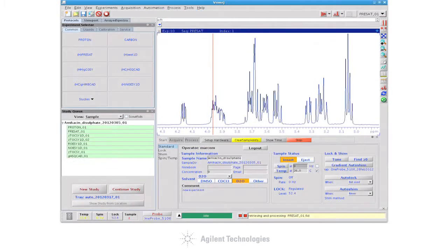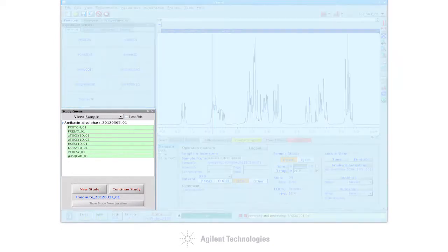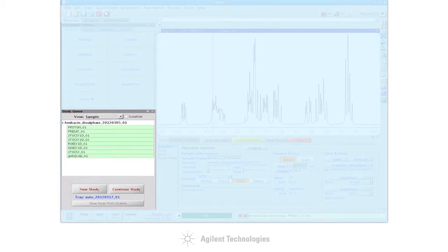One of the strengths of Agilent's VNMRJ3 software lies with the ability of the users to customize the interface to suit their personal needs.